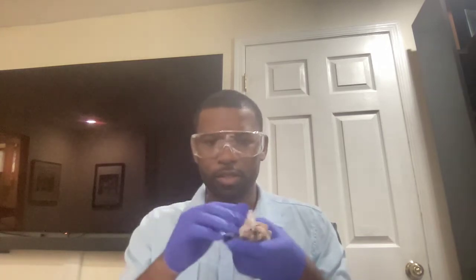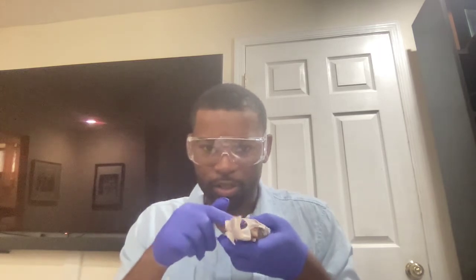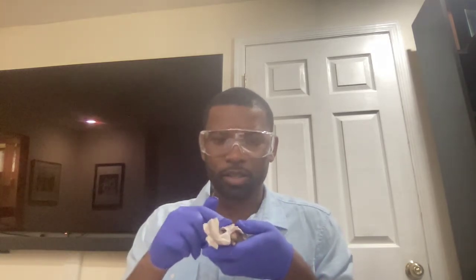So I will be doing a video on the dissection of the sheep brain. The first thing I saw when I did this dissection were these layers, this outer covering. This is called the meninges. The meninges covers the entire brain, and then the outermost layer is the dura mater. So that's what you can see right here.